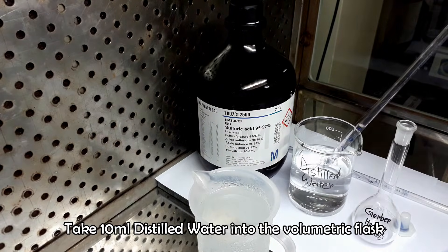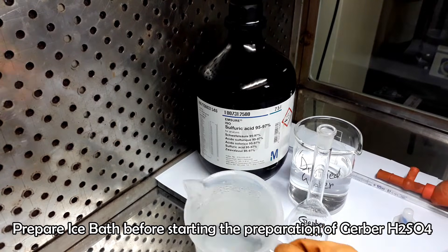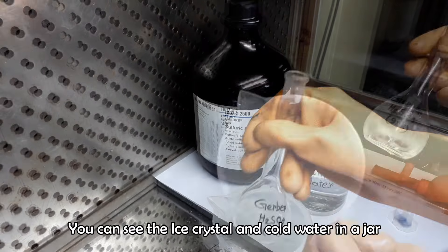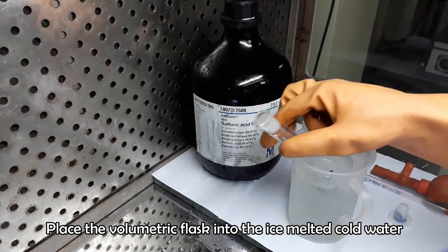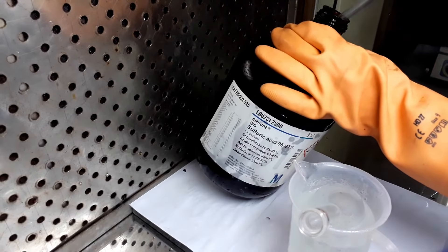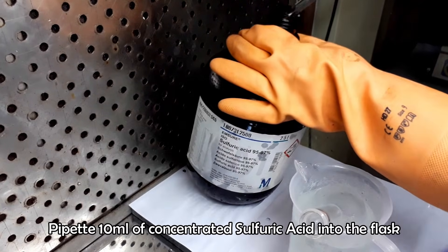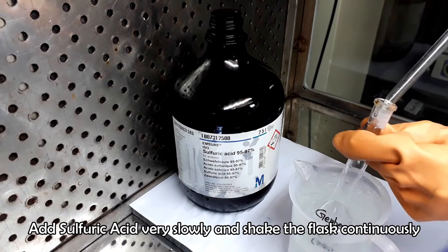First of all, take 10 ml of distilled water into the 100 ml flask, as we want to prepare a 90% acid solution. You can see ice with cold water in the jar. Place the flask inside the ice-cold water because we want to prepare it in a cold environment to prevent vigorous reaction of the acid with water inside the flask. Pipette 10 ml of concentrated sulfuric acid and pour it into the flask very slowly, keeping the flask shaking continuously in ice-cold water.